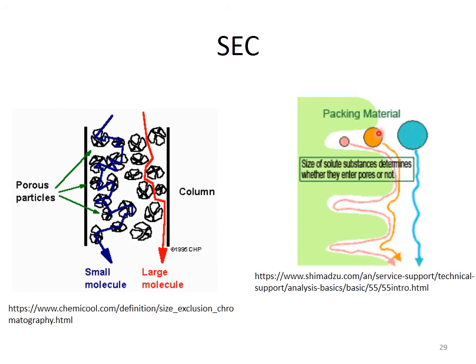The proteins with intermediate size will penetrate the beads, but only to a partial extent, and hence they will take relatively less time to be eluted from the column. Whereas the proteins with the largest molecular mass will not be able to penetrate the beads, and hence they are going to move through the interstitial spaces. So the proteins with larger size are going to be eluted from the column first, followed by smaller proteins.